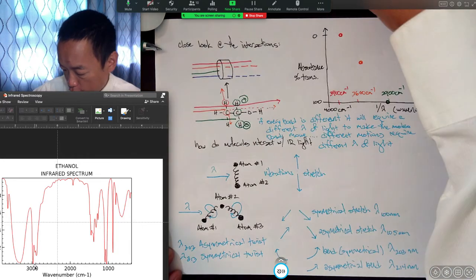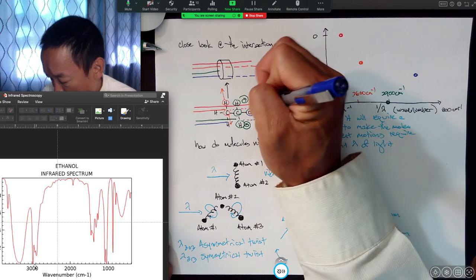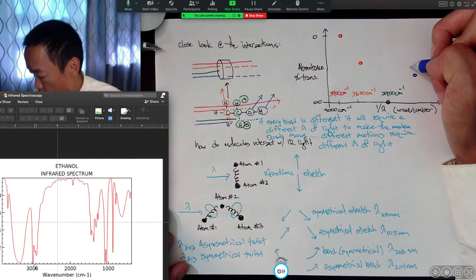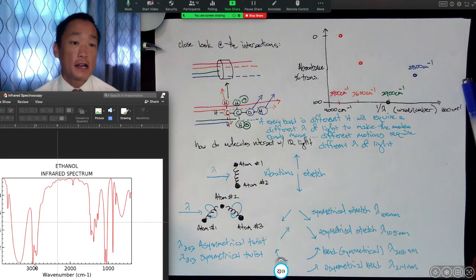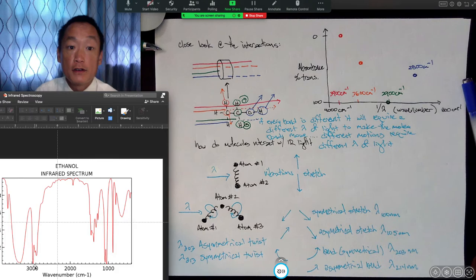And then the blue portion again here is the interaction perhaps, and passing through that maybe made this and this portion move in the same direction with respect to one another, and you end up with the sample that's maybe at, let's say, 2,800 inverse centimeters. What I'm just trying to say is every bond has its own energy. Every bond then has its own motion that's codependent on a slightly different type of energy, and those energies are being afforded by this sample, by this light source that's tuned to the infrared region.